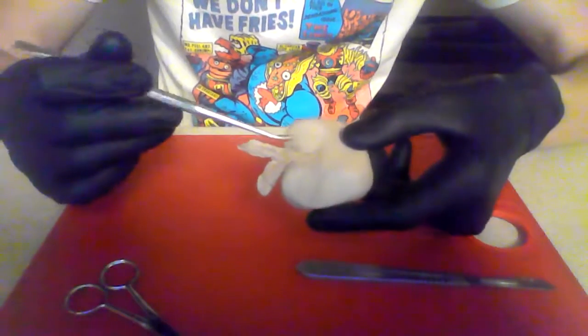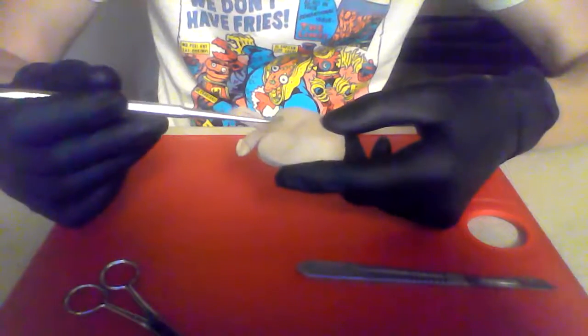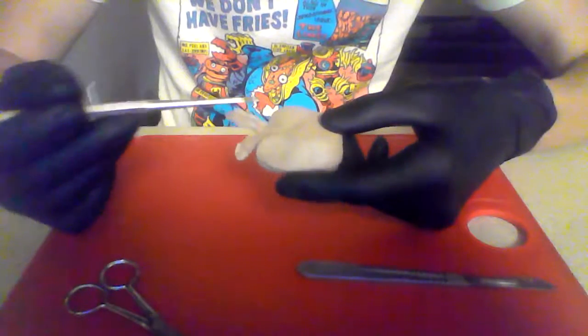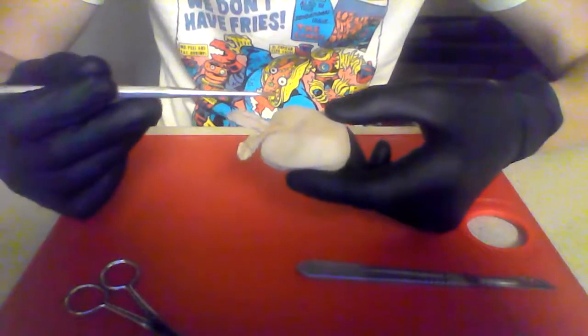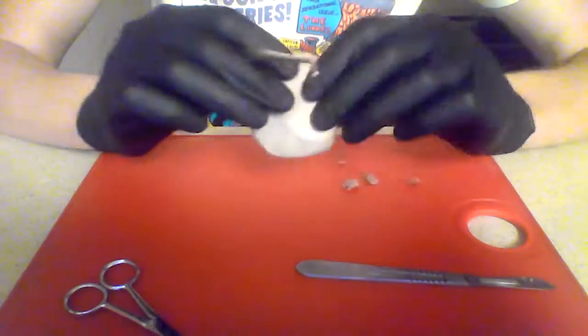Okay, so here we have the kidney, and I apologize for the terrible video quality. It's just the camera I have on my laptop. Okay, so here we have the sheep kidney.